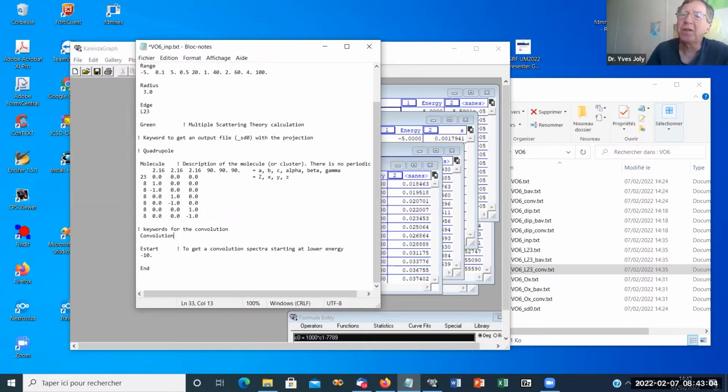So he did Monte Carlo simulations and so on, and averaged over all these Monte Carlo simulations with an average of the second shell around the absorbing atom. This again slightly improved, not the first bump, but the following bumps for this kind of problem. So now, about what you said.